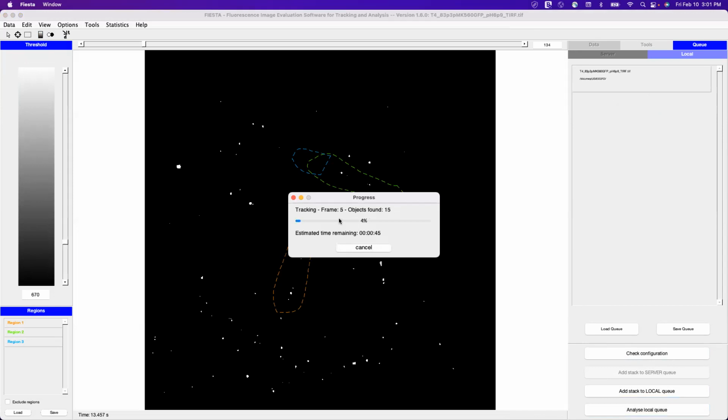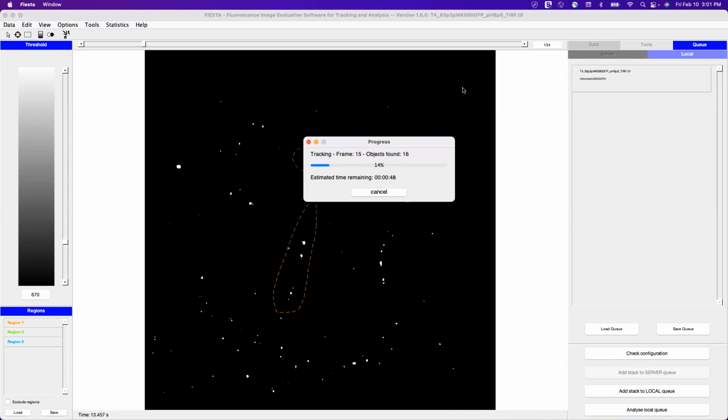All right, so now it's going to go through. Again, it's just doing positional changes right now. Give it 45 seconds. But for the actual MATLAB analysis, you're probably going to have to write your own. We might have some, but if you're doing a specific experiment, you're probably going to have to.